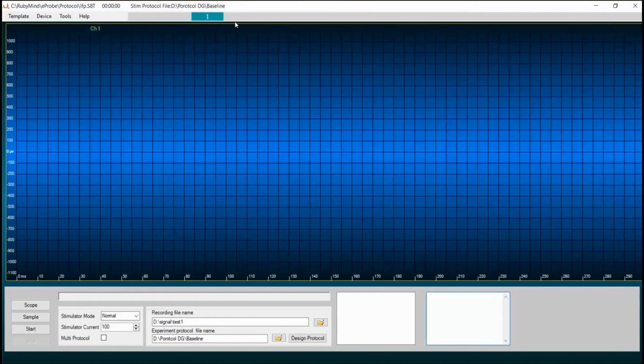For connecting ePulse and eLab, as you know, there's a connecting cable with HDMI at the two heads, which connects to the top of eLab and ePulse. Well, at the top screen, you will observe the signal. If I have a right click on it, the scope settings will come up.